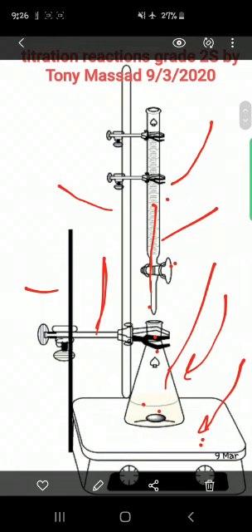In the beaker, the volume of the Fe2+ is known, but let us just consider that in this case the molar concentration of the Fe2+, C, is the unknown. So the legends that you have right now: for the MnO4-, you have C1 and V1E, both known, and you've got C2 unknown for the Fe2+, and V2 is the known volume that you measured with the volumetric pipette and introduced right into the flask.